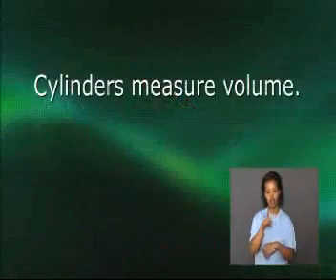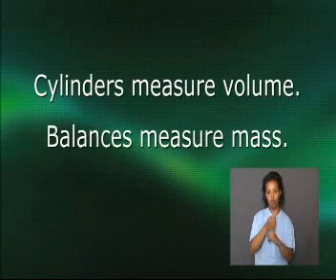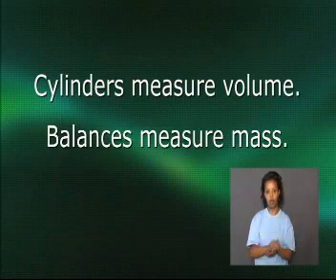Welcome back, students. I trust that was a simple activity for you. Cylinders measure volume and balances measure mass. Did you write down the same answers? If so, great work. Let us carry on with the lesson.